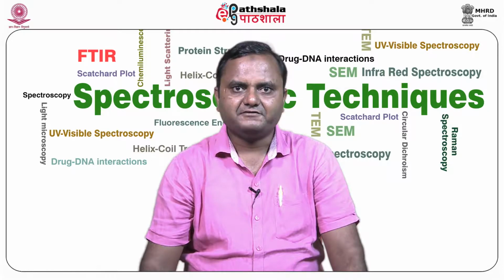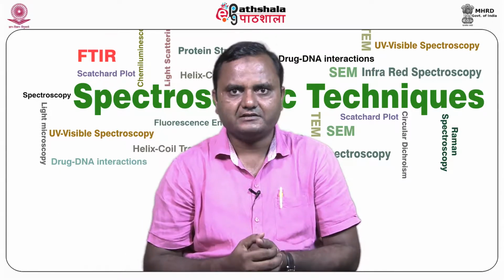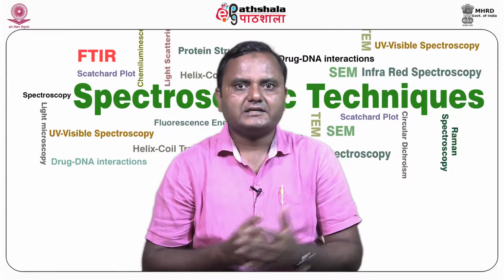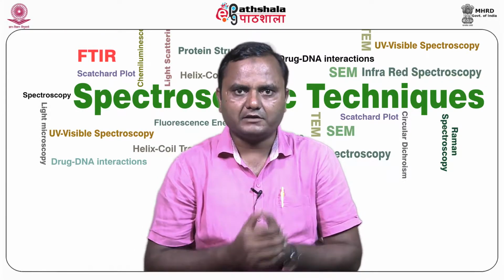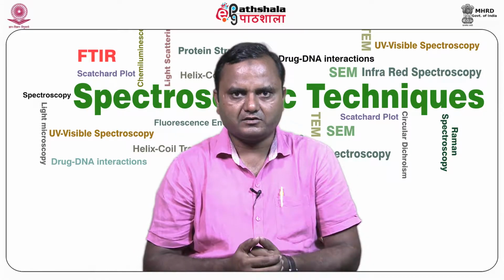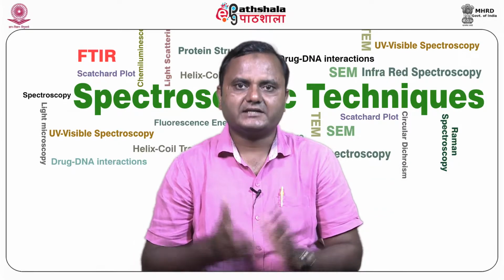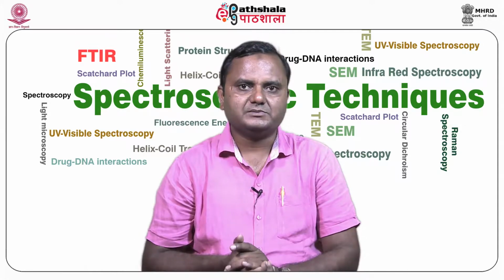Light scattering is simply defined as when a beam of light interacts with objects and is scattered in different directions, and this scattered light enters our eye, and the eye lens forms an image on the retina. Light scattering is the consequence of interaction of light with the electric field of a small particle or molecule, a process by which particles suspended in a medium of a different index of refraction diffuse a proportion of incident radiation in all directions. This radiation energy is called scattered light. No energy transformation results, only a change in the spatial distribution of the radiation.